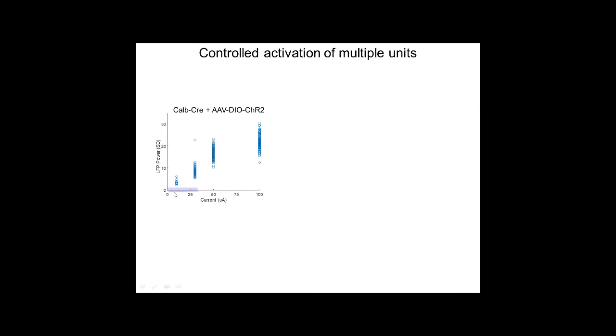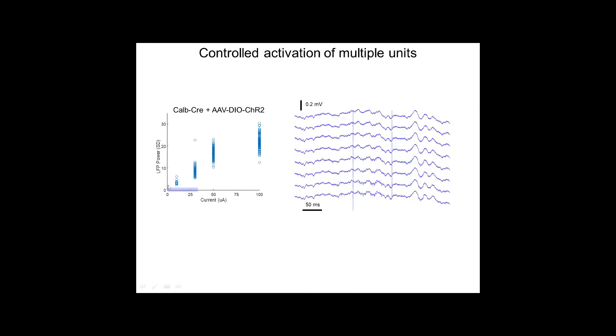So if I am moving into the low current, between 10 and 30 microamperes, they can control whether we shed more or less light. That will depend, of course, on the level of opsin expression that you have, and precisely activate a few cells.